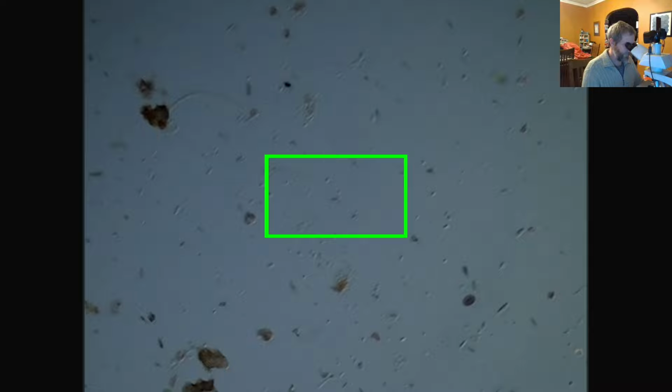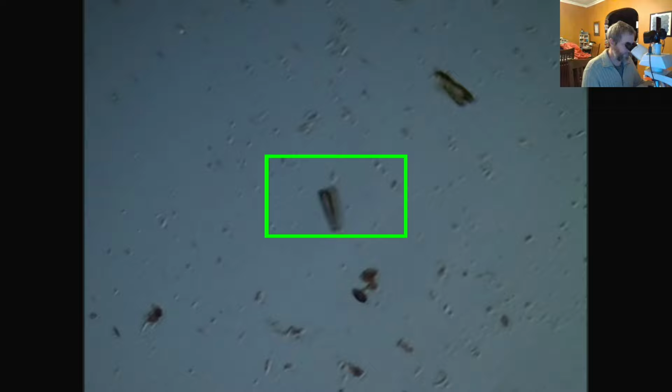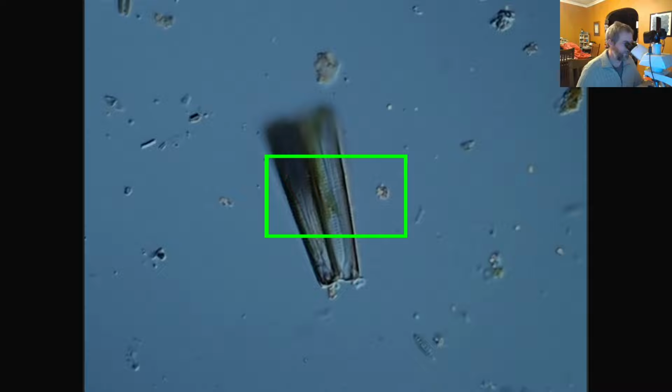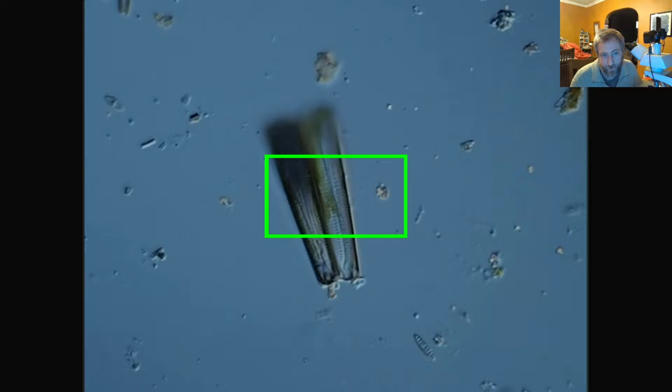So you can see all that organic matter that's present in the slide. Here's an example of our Gomphonema monster in girdle view. Again, it has sort of a fan shape. They live in these sort of fan-shaped colonies. So I can zoom up slowly. You can see this is what it looks like at 20x, right? And then this is what it looks like at 40x. That's 400 times magnification, because the eyepiece is another 10x magnifier. And we can start to see the important structures of the diatom at that size. Again, it's in girdle view, but here we're actually looking at two full cells.